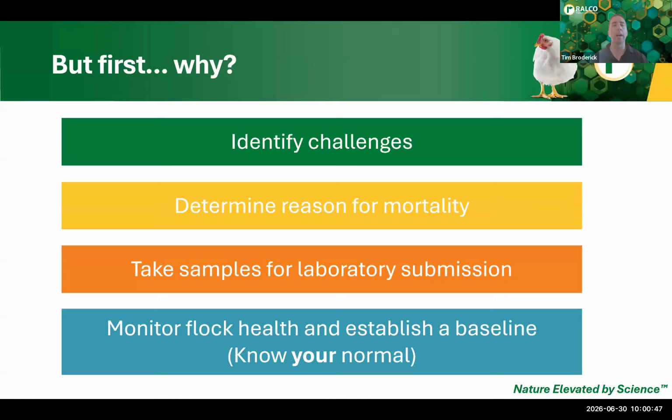So to get started, why are we actually here? What's the value of necropsy or a field posting? Really, in our use, it's a great barometer for flock health and identification of different challenges, both within disease and production performance. We usually use it first as a baseline. We want to monitor flock health and understand what our birds look like both inside and out. Knowing your normal, that way you can communicate with the broader technical team as to why.